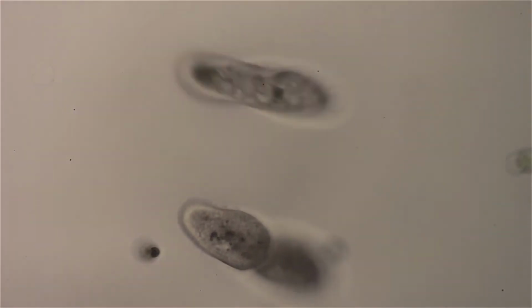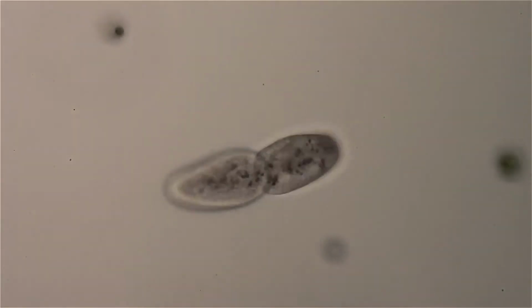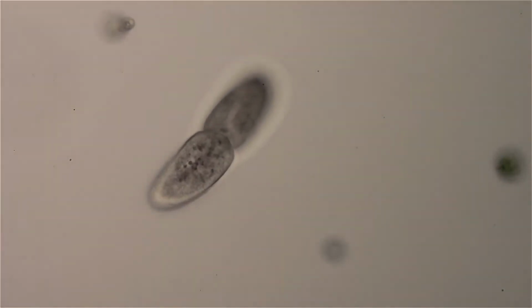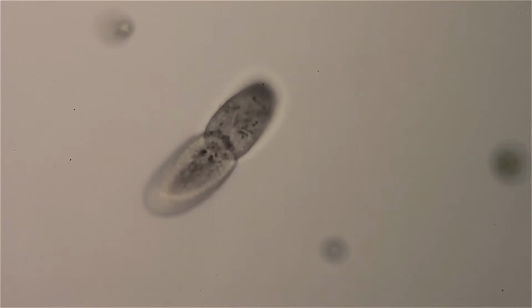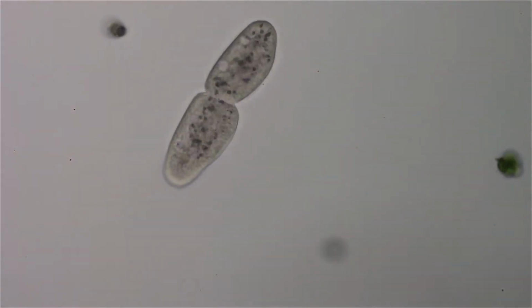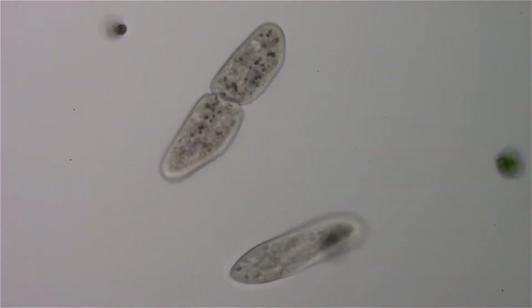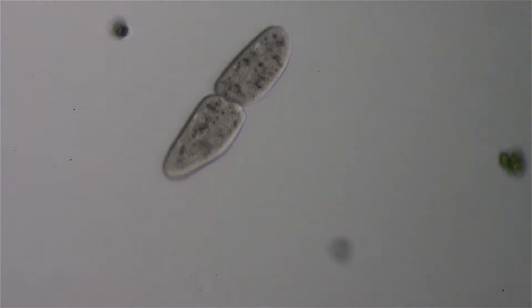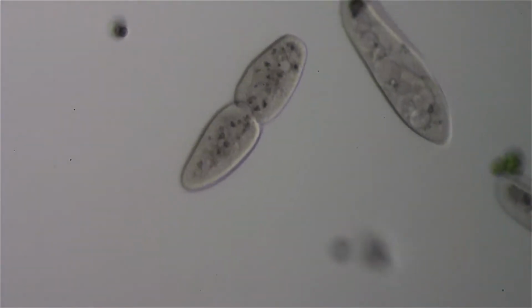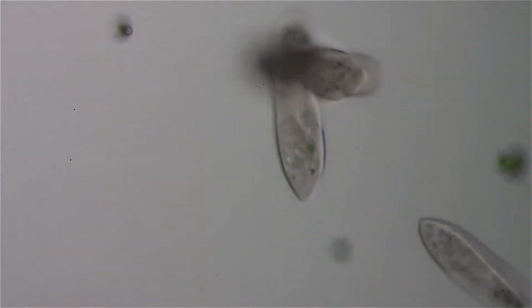The primary interest of this video is this Paramecium you see here in the middle of cellular division. He came out of a jar that I've been feeding brewer's yeast to, and it seems like all the extra food available to him triggers the division you see here.